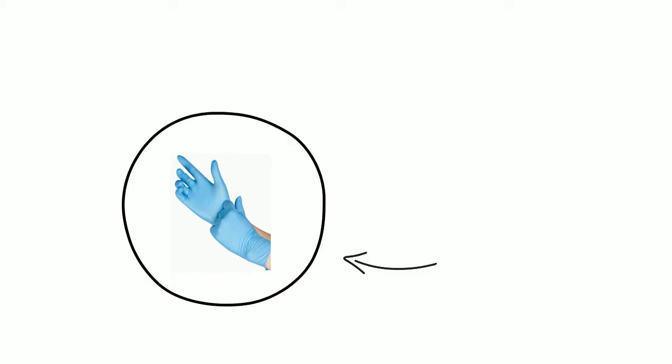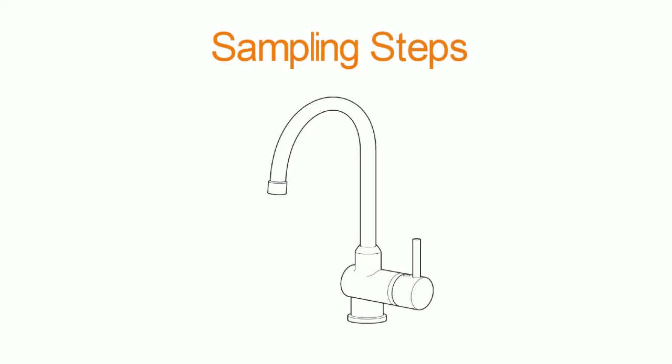It is recommended to wear powderless nitrile gloves during sampling and sample handling. If your sampling point has a faucet with an aerator, the aerator must be removed prior to collection. Flush the cold water sampling line for three to five minutes or until the water reaches a constant temperature prior to sampling. Open the bottle to be used for collection. Do not touch the inside of the cap or around the edge of the bottle as this could lead to contamination of your samples.